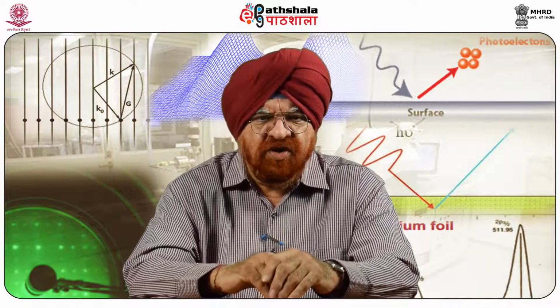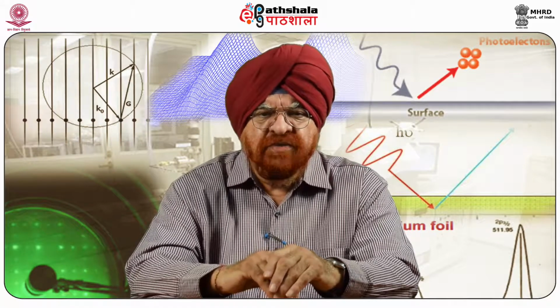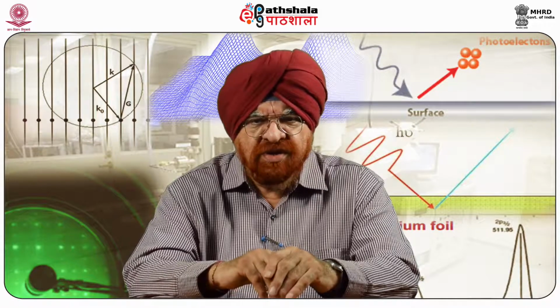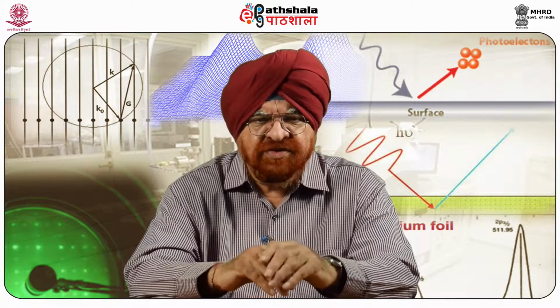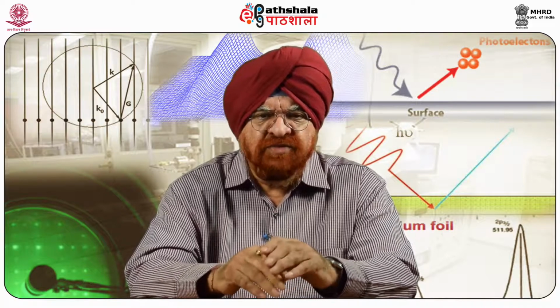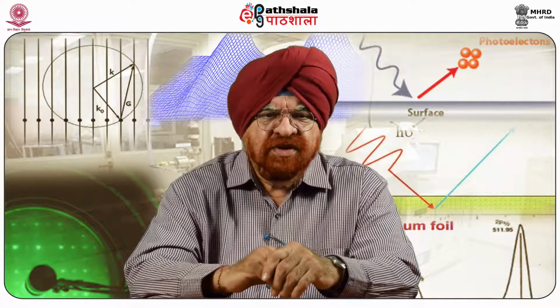Magnetic force microscopy is a variety of atomic force microscope where a sharp magnetized tip scans a magnetic sample. The tip-sample magnetic interactions are detected and used to reconstruct the magnetic structure of the sample surface. Many kinds of magnetic interactions are measured by MFM, including magnetic dipole-dipole interactions.